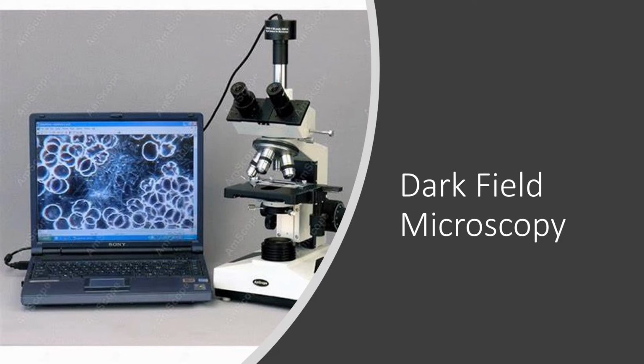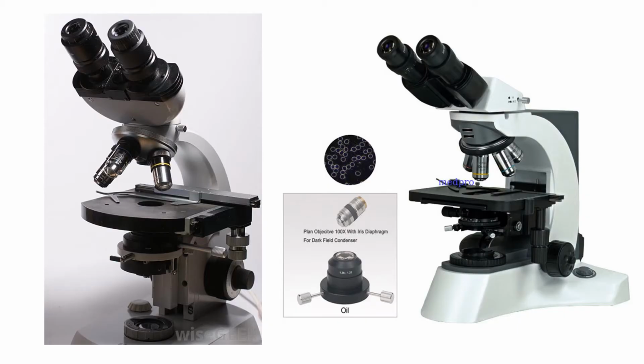Okay, so let's get started with dark field microscopy. Can you see the image over here? Can you make out that it has some kind of dark field, and there are some cells over it, and the laptop is connected to it? But it is not important that a laptop will always be connected to see the image from a dark field microscope. There could be binocular dark field microscopes also, which help us to see the images.